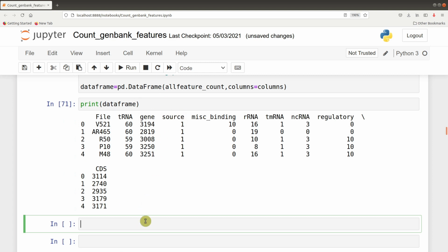So this is the data frame. So notice how nicely the data has been arranged for us. So now we have our columns and we have our values also here. Now with a pandas data frame, we have column headers and we also have the index. This side here, these numbers here represent the index. Indexes and columns are used to make queries.